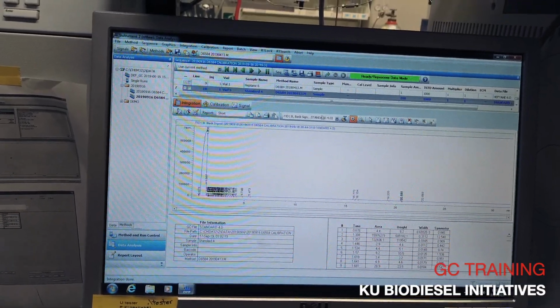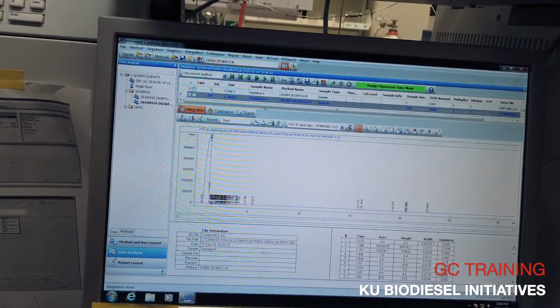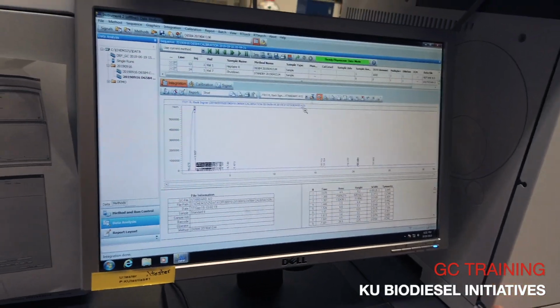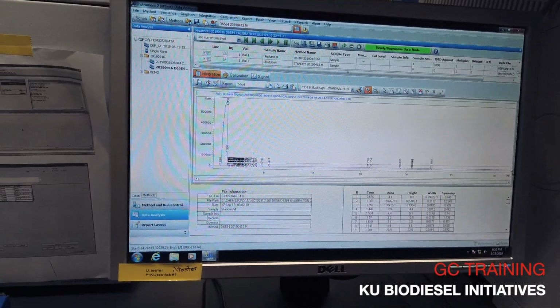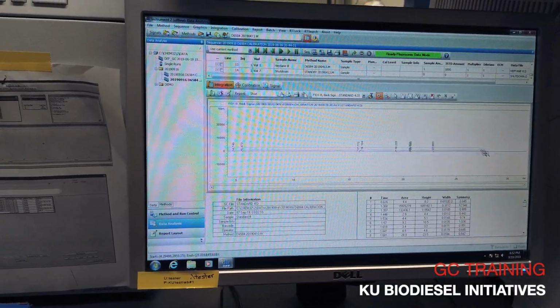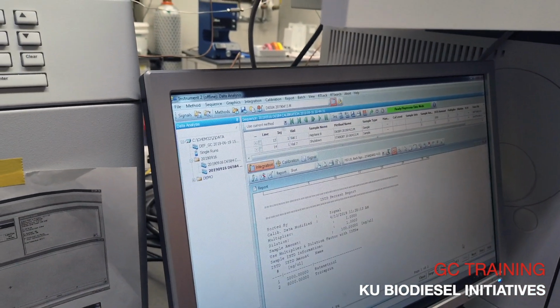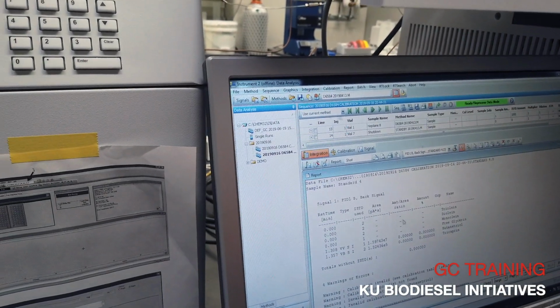So now we're gonna go through, actually, here, I'm gonna get a piece of paper. Let's see if it'll let me do that. It's not connected to the printer. Oh, I don't need it to actually be printed.